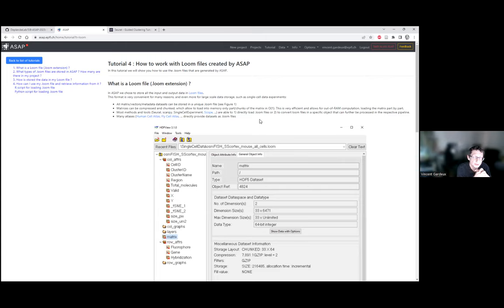For plants and other species, if an ontology is missing, please don't hesitate to tell us through the feedback button, and we can try to integrate it. It's not too hard for us to integrate a new ontology if it exists. It takes maybe half a day of work. So if you know the best one for a specific species and we don't have it, please tell us and we will just add it.